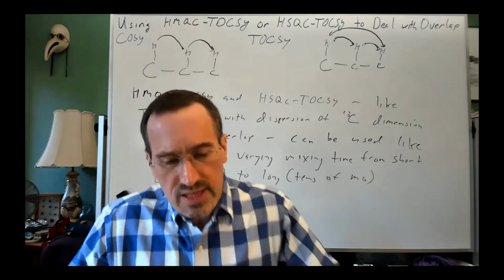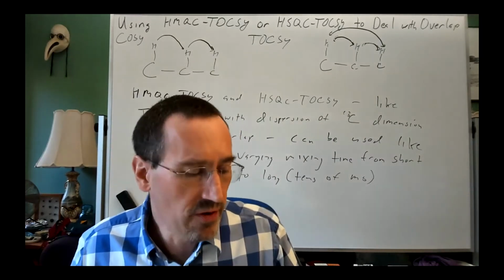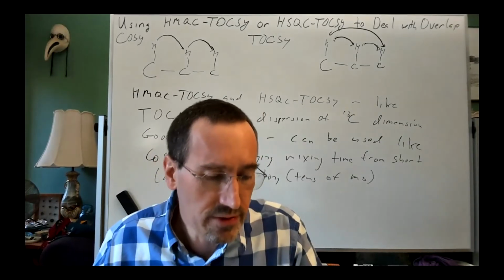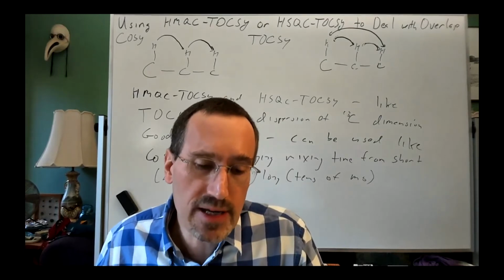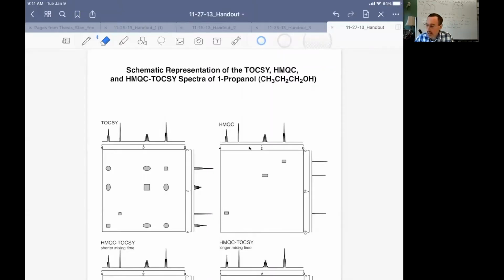So I think where I want to start us, because this sounds very abstract, is a diagram, and then we'll actually move on to a concrete example, which I've taken from this book I mentioned that I used for the 2004 when I introduced this, Croasmun and Carlson. So let me share my screen, and I'm going to bring us to the third page of our handout. So this is the third page of the handout.